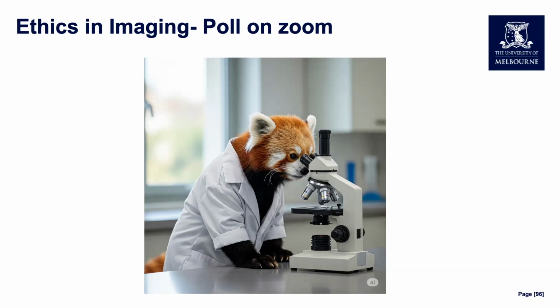Which follows on to question number 2. Which of the following statements is correct? And the hint was select all that apply. So the correct answers here are modification should be performed to the whole image, and also modification should be reported in the figure legend. And yeah, it's good to see that most people got those answers correct.